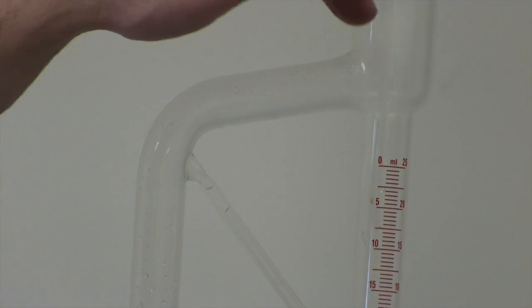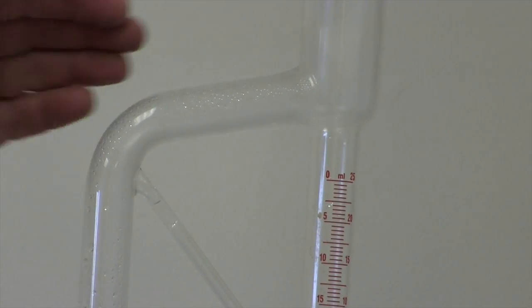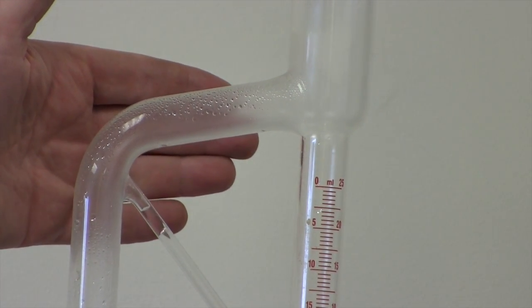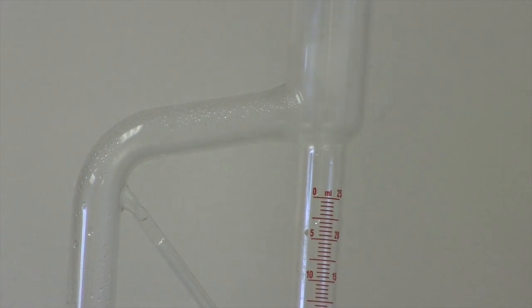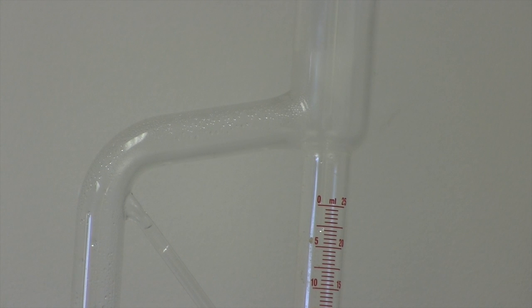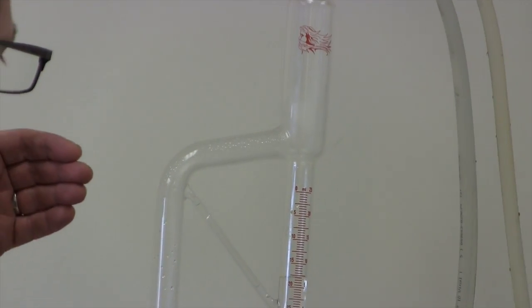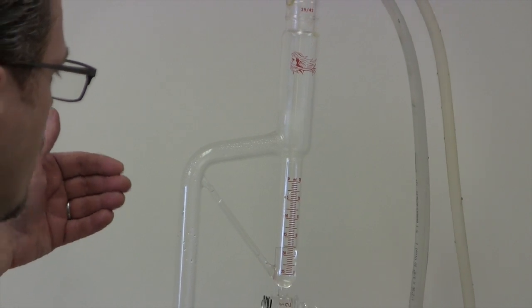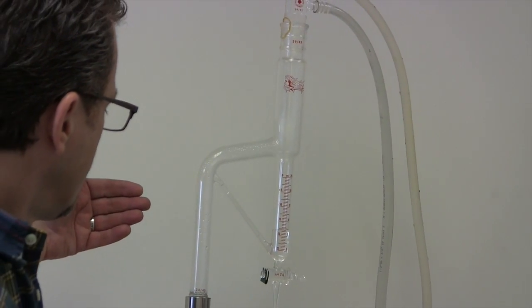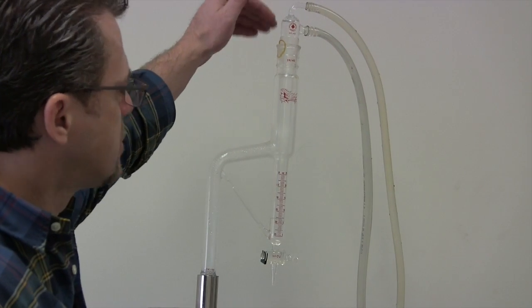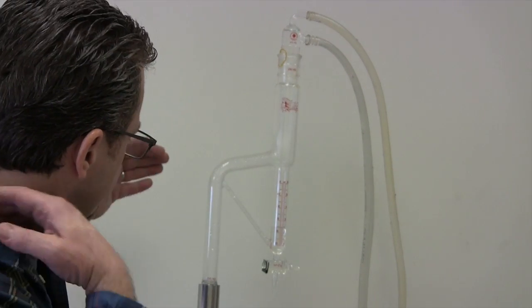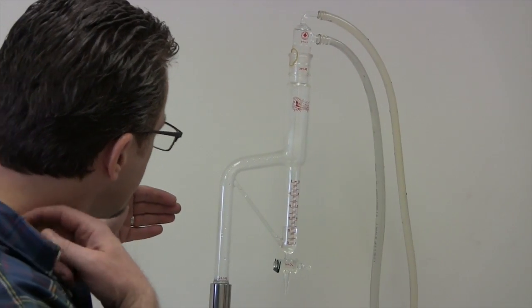we'll start to see drops of water and oil coming over. And it'll start coming over really at a pretty good clip. At which point we will want to kind of regulate how fast it comes over. We don't want it really coming over too fast, because then we'll lose some oil at the top. So I'll moderate the temperature once that starts.